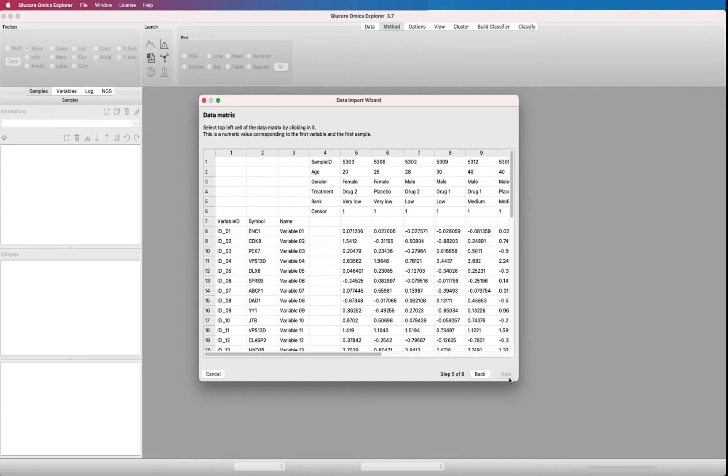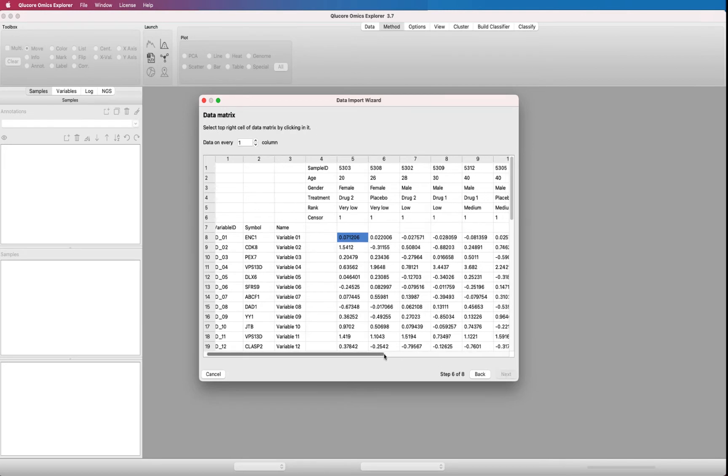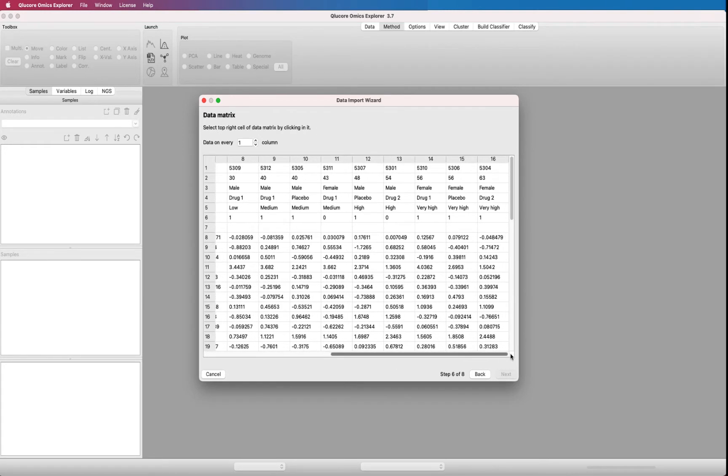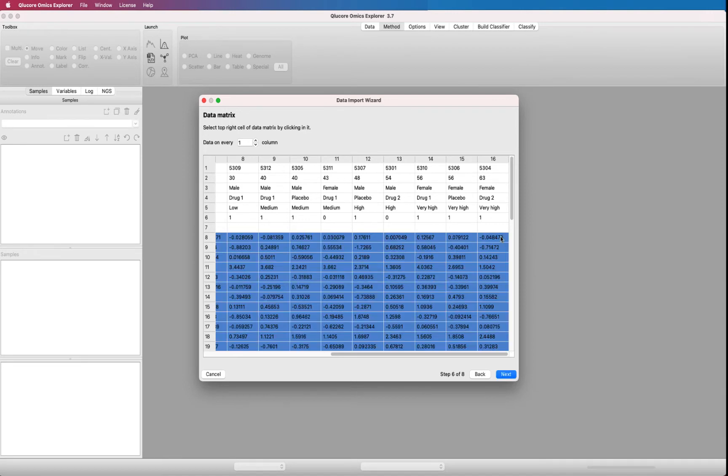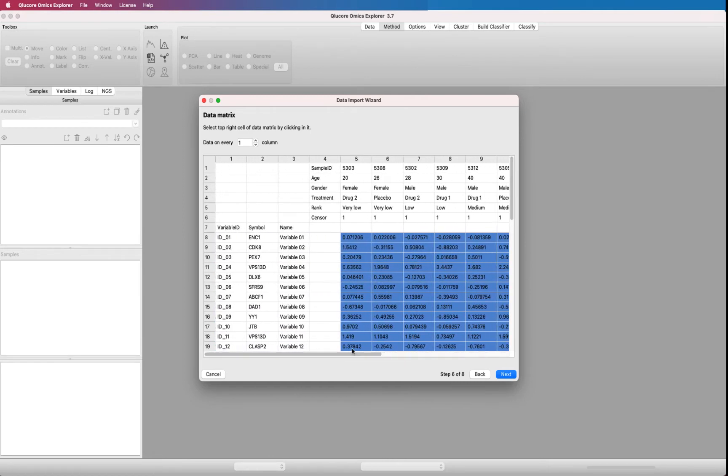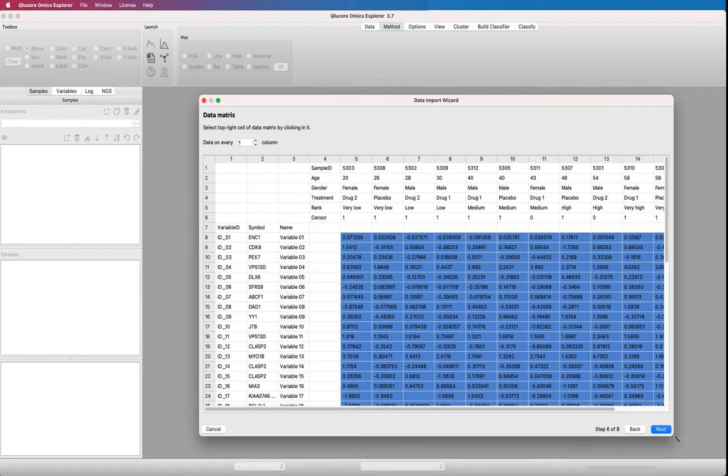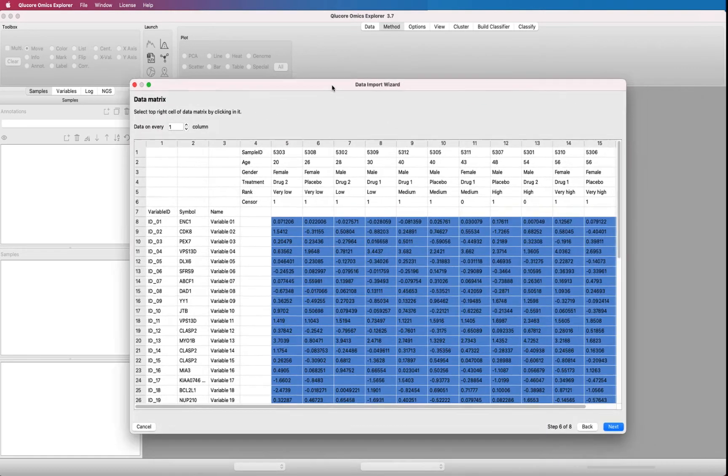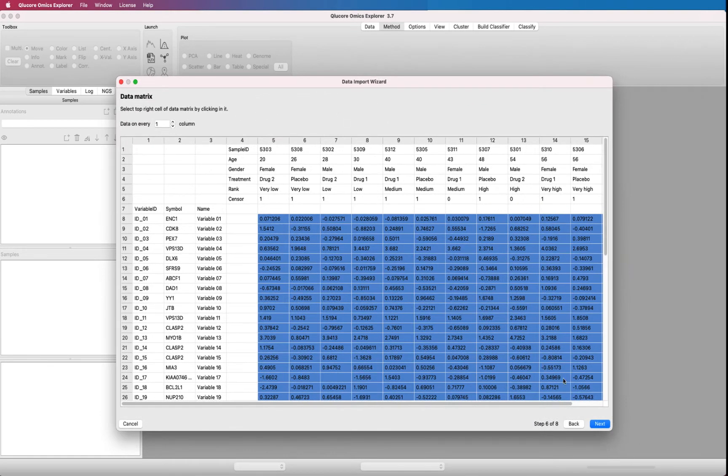Select top left data cell. Then press next. Select top right data cell. For a data set with many columns, it might be necessary to scroll to the right to identify the upper right cell of the data. The whole data block will then be marked in blue. We have now defined which part of the file contains the measured data.